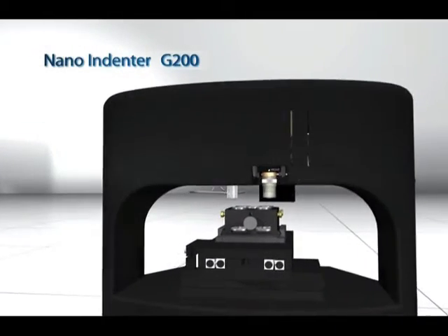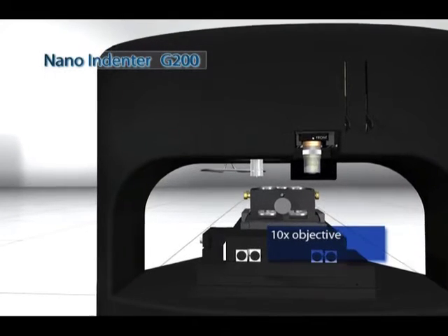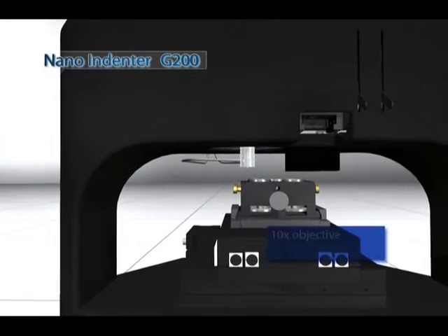When working with challenging samples that require precise targeting, the microscope objectives can be easily interchanged.